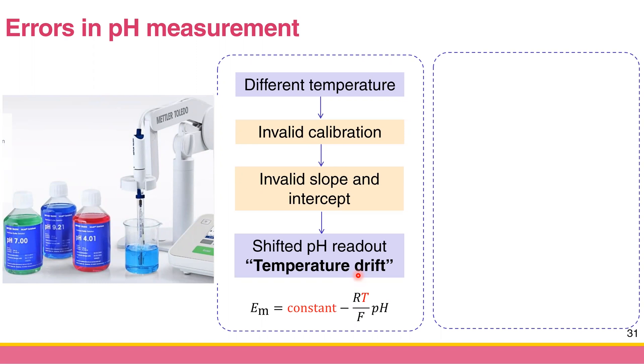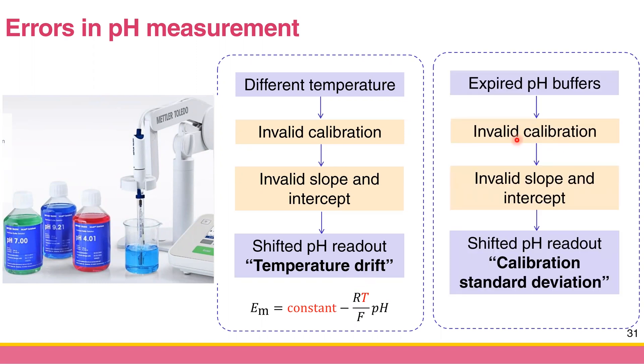The sixth error is deviation of the calibration standard. If your pH buffer is expired or contaminated, your calibration is not valid anymore and your readout will be shifted. If your standard is not correct, how can your sample pH readout be correct? These are the six major types of errors in pH measurement, though there may be more in the textbook.